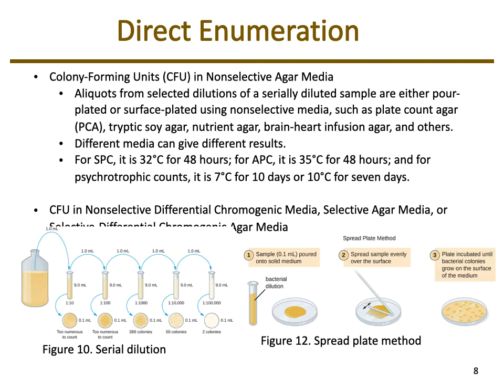If we're using different media, or we're looking at different types of organisms, like those psychrotrophic bacteria, for those counts, they would actually be at 7 degrees Celsius for 10 days, or 10 degrees Celsius for 7 days. So that would be a much longer incubation period than if we were just doing a standard plate count. So again, protocols would govern how long. It's not like the microbiome lab where you're like, okay, well, we don't meet again for a week, so it's going to incubate for a week. You would have to pull plates and do readings at a set time.